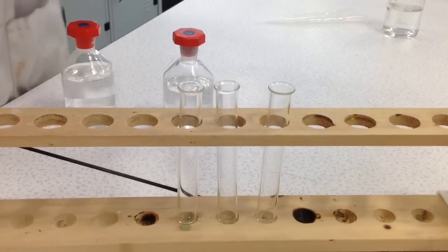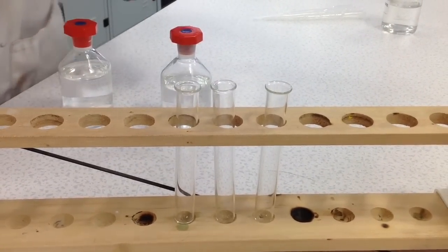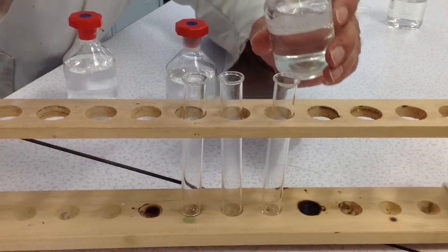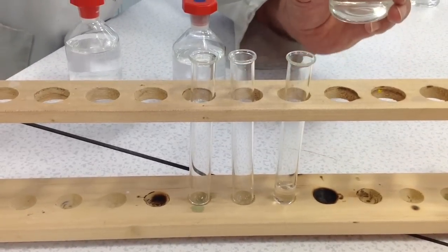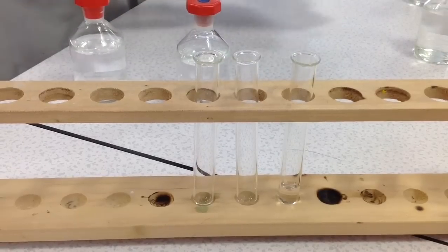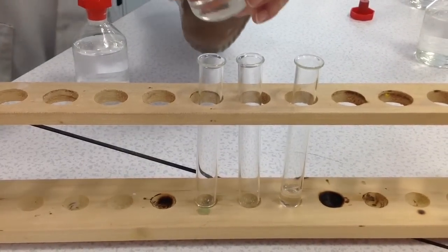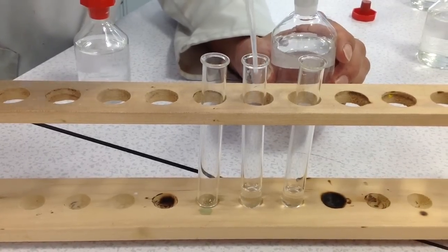Hello again. Next we're going to show you 3 tests to distinguish between the chloride, bromide and iodide ions. First I'm going to add some sodium chloride to that tube. Next some potassium bromide to the next tube.